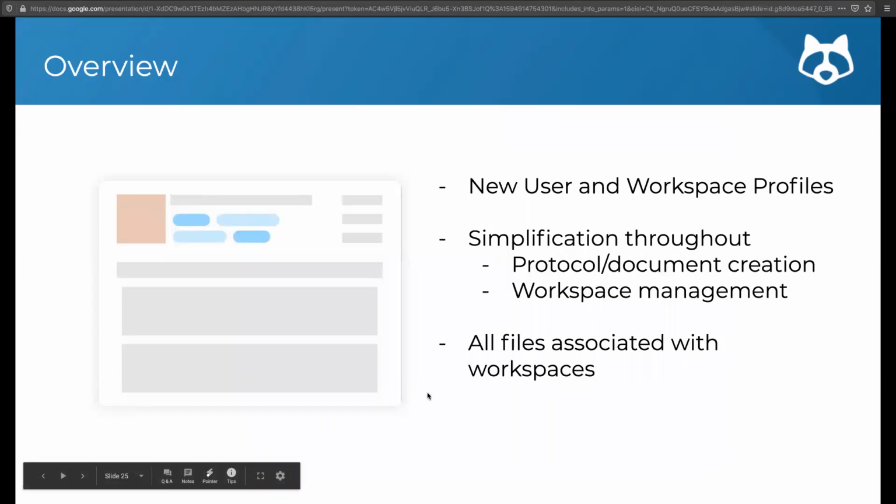And so, a quick overview of everything that we discussed today. There's going to be new user and workspace profiles. New user profiles have already been rolled out, so you might have noticed that change. We have a simplification throughout the overall workflow, and that's for creating protocols and documents, but also workspace management. And most importantly, all files associated with your My Files folder previously will be moved to a particular workspace, either a new workspace that you create or an existing workspace that you have.